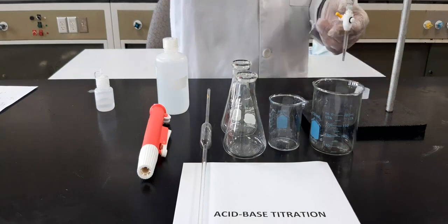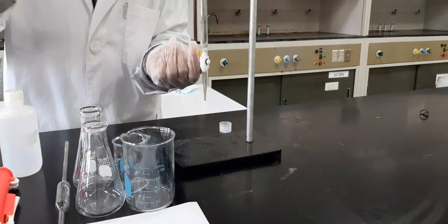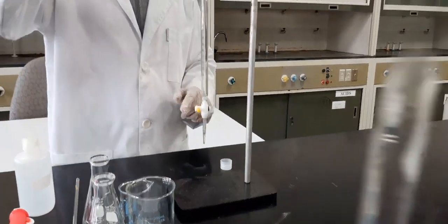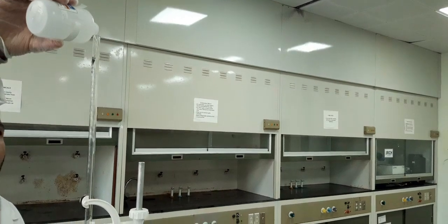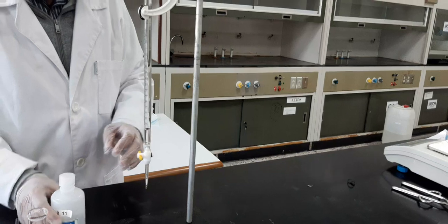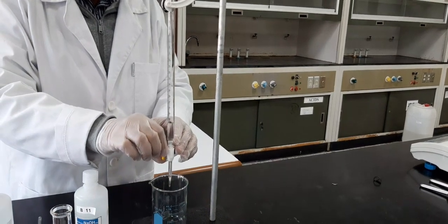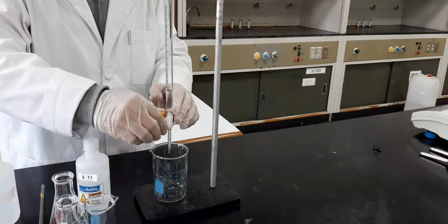With the help of this, make sure that this is the stop position. We can open it like this, the open position. When you cross it like this, it is the stop position. Make sure it is in the stop position. Then we add a little bit of base solution so that we wash it with the same solution. We have a beaker for washing purposes. We want to remove this base solution, to wash out any impurity inside.